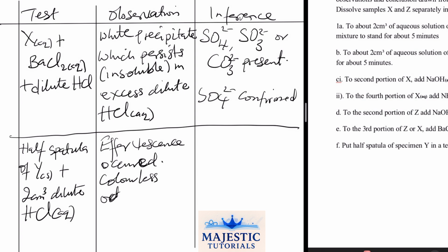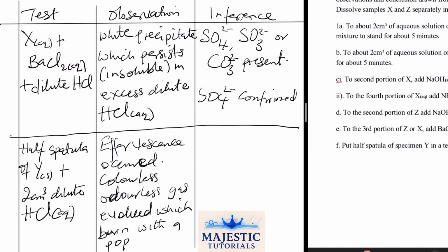Colorless, odorless gas evolved, which burns with a pop sound.